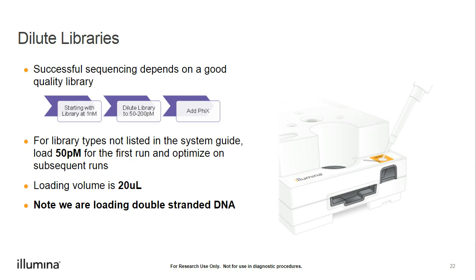All right, and then the next thing that I'm going to show you is a video resource that goes over sequencing and how to start up a run on the iSeq 100 instrument. This is a user starting a run from a Local Run Manager run. And so we can go ahead and take a look at this video resource here.